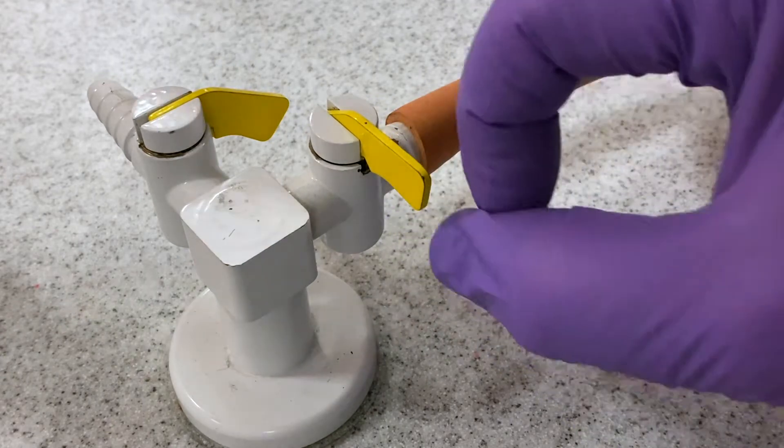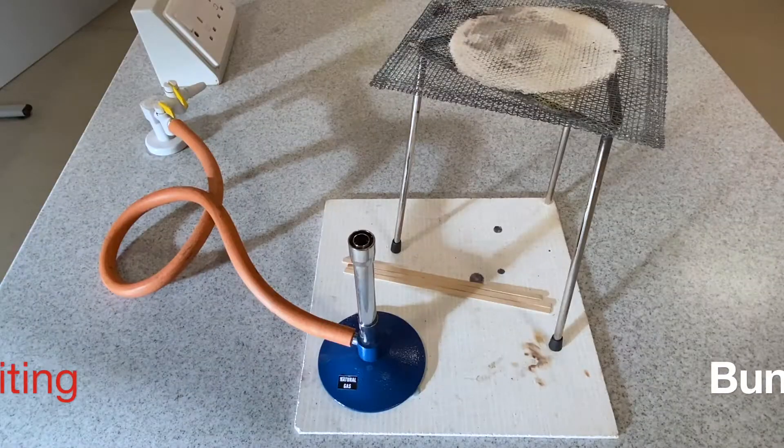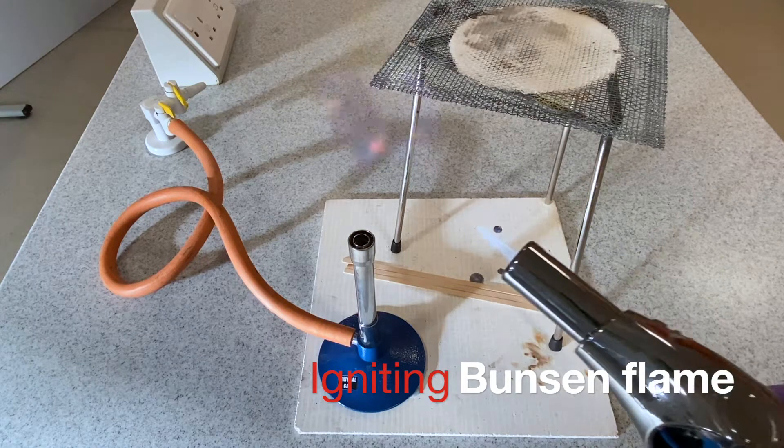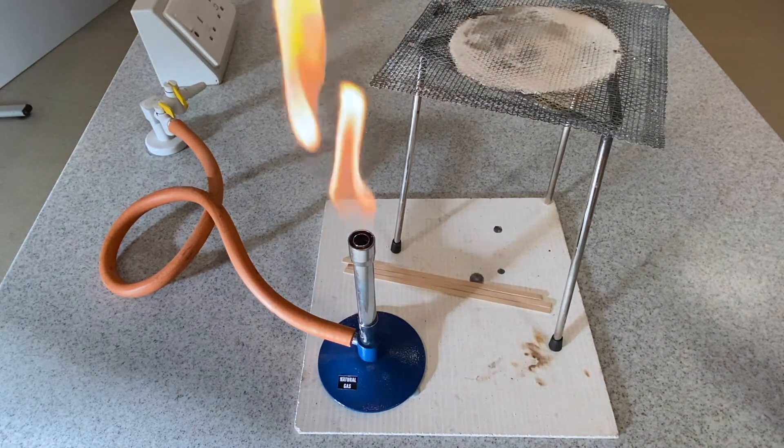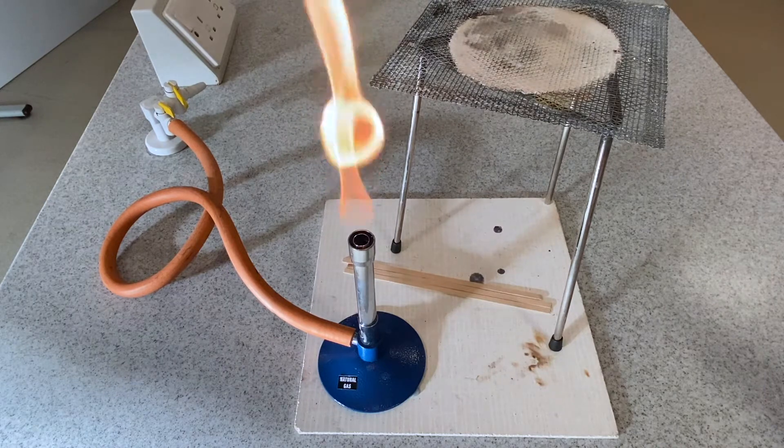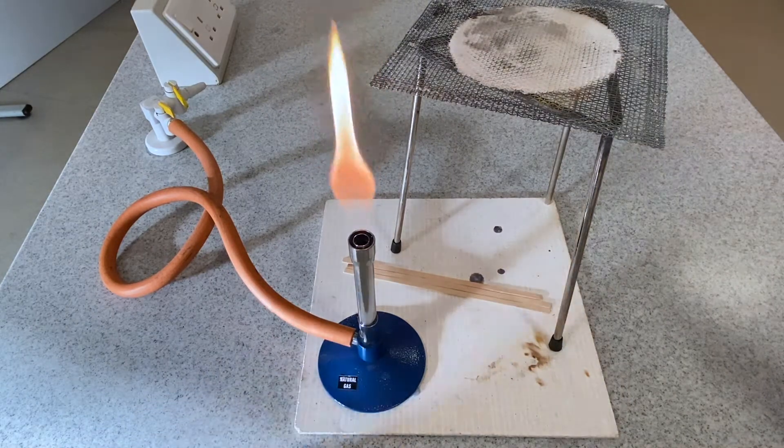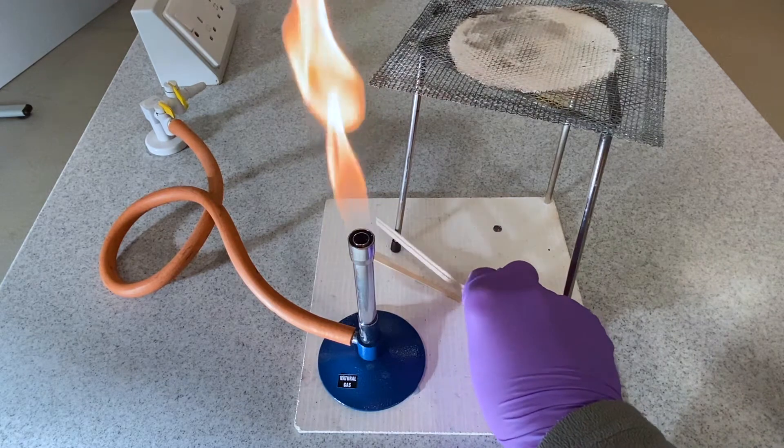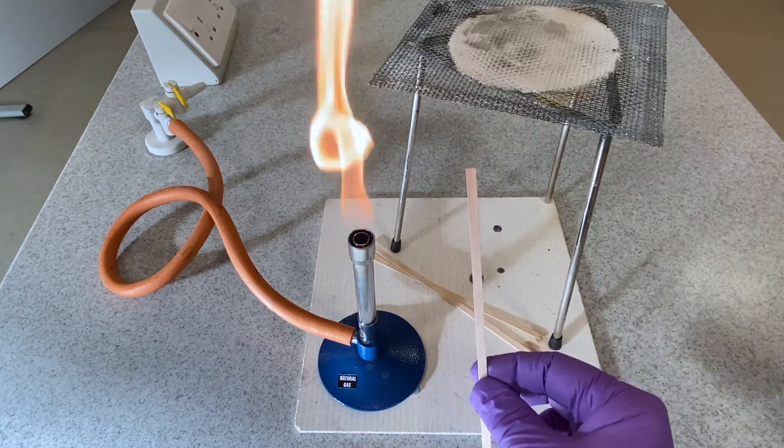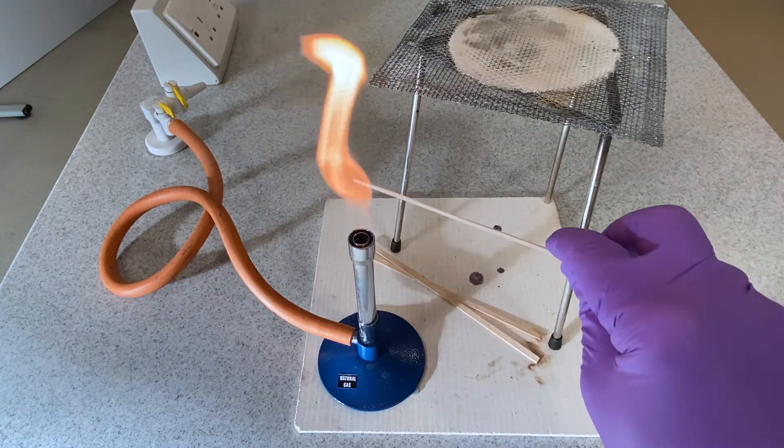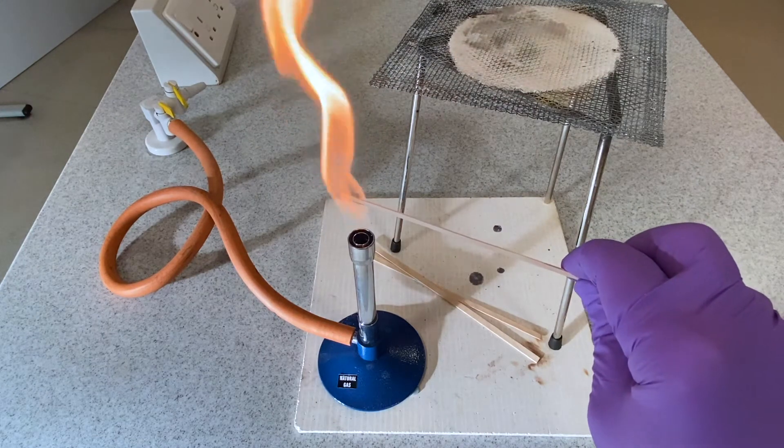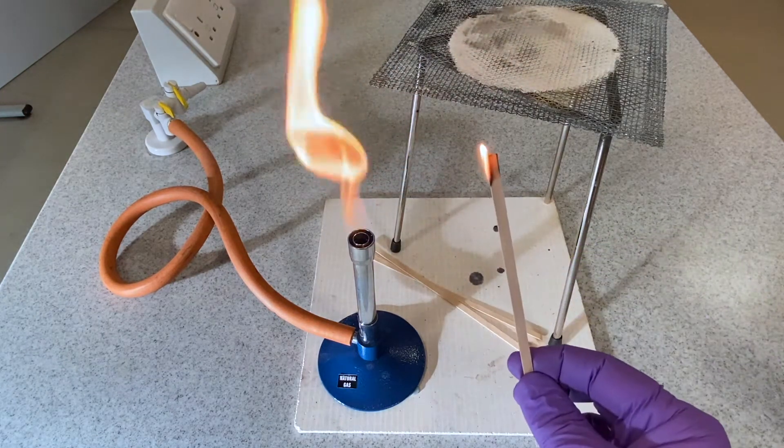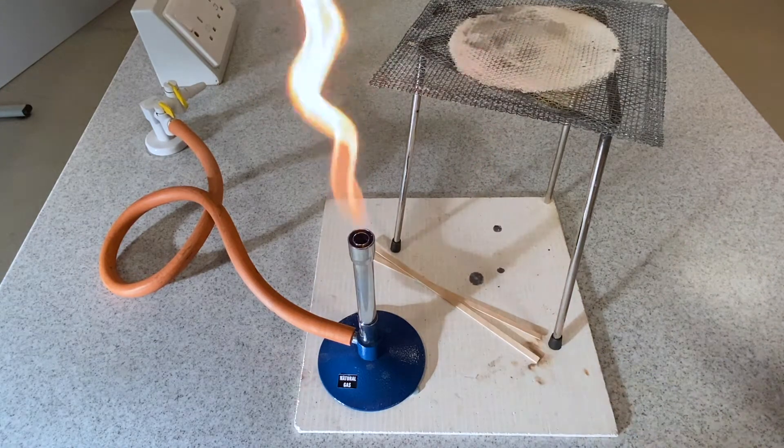The Bunsen flame can be lit using a gas lighter or from a splint. It is best not to use matches directly to ignite the Bunsen. Always ignite the Bunsen on a luminous flame, which means the collar at the base of the Bunsen burner is closed.